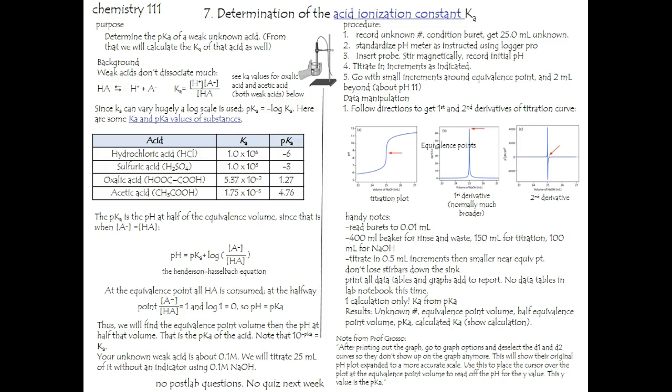Okay, this is experiment number 7, determination of the acid ionization constant.